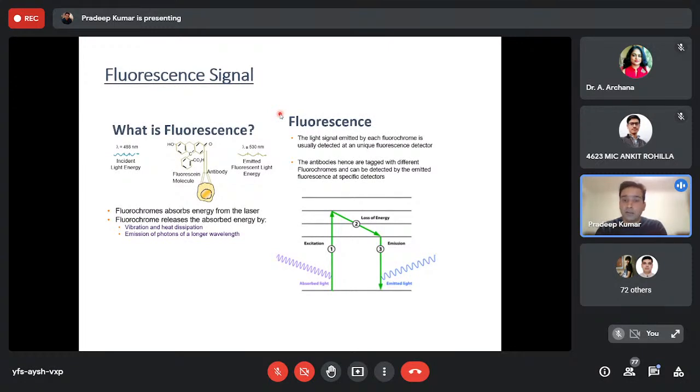Okay, now you can raise your antibody in your lab as well. Like you expose, let's say, your mouse to a foreign antigen, so the immune system of the mouse will develop antibodies against it, and then you can extract the organ from the mouse, and then you can purify that antibody. But that's a very lengthy procedure, so most of the time people don't raise those antibodies, and they use commercially available antibodies tagged to fluorochromes.